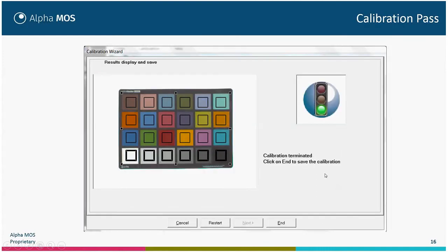The system will then check all colors and determine if the calibration is passed or failed. If it fails, one possibility is that the color checker is in the wrong direction — if you put the white on the back right, the calibration will fail. It can also indicate a lighting problem. When done, you click End.